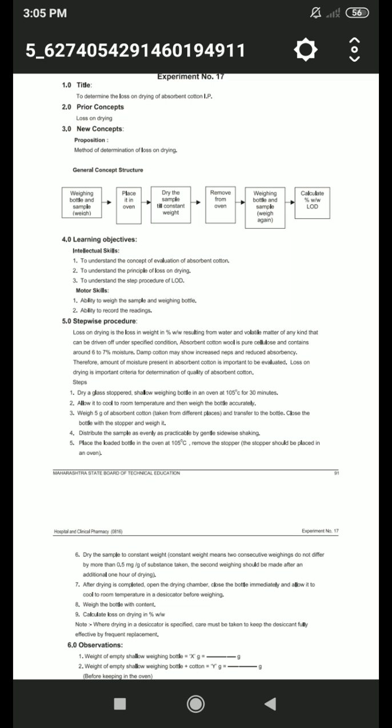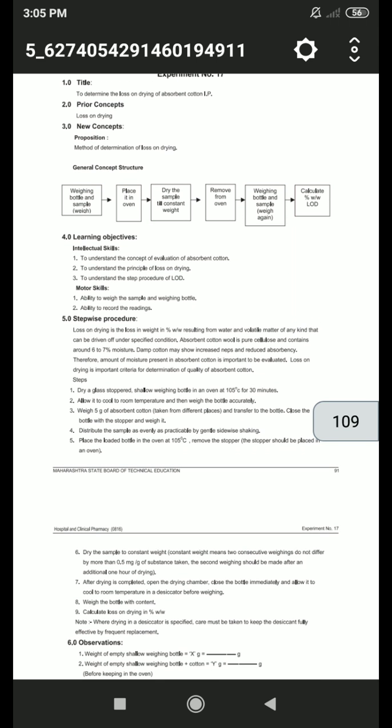Desiccators are sealable enclosures containing desiccants, used for preserving moisture-sensitive items such as cobalt chloride paper and for other uses. A common use for desiccators is to protect chemicals which are hygroscopic or which react with water from humidity. Desiccant is used in the desiccator. Desiccants are drying agents that extract water from a wide range of materials.